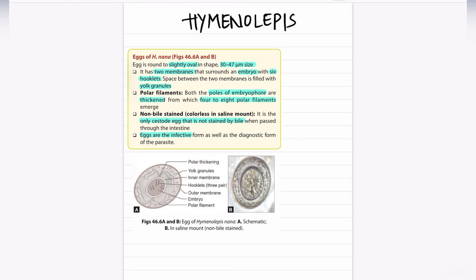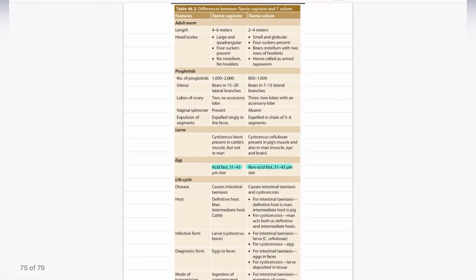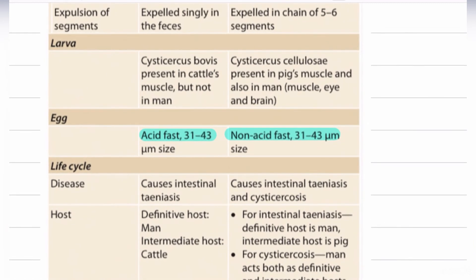Next, we are going to discuss about the eggs of Taenia saginata and Taenia solium. The main difference is that the egg of Taenia saginata is acid-fast, whereas the egg of Taenia solium is non-acid-fast. The size is the same for both, measuring 31 to 43 micrometers.